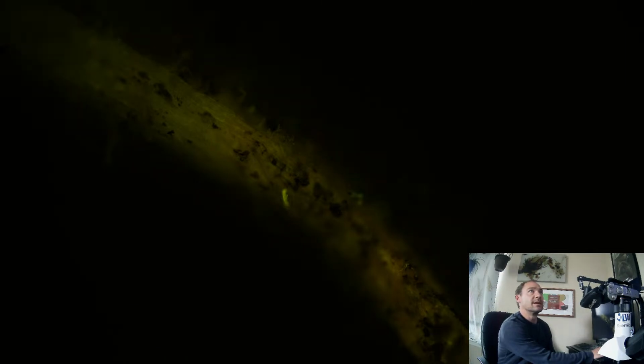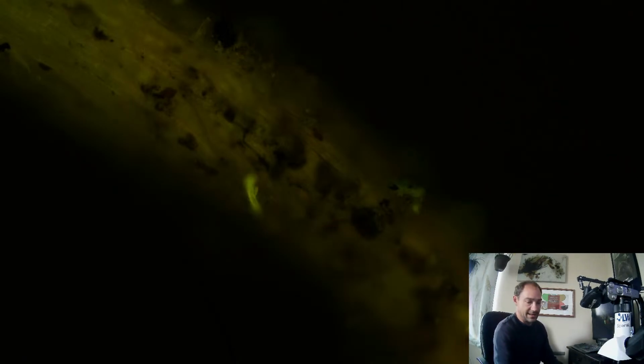Here we can zoom in. We'll go into 2x, and it's interesting. We already see this black line right here. That's definitely a fungal hyphae. Oh, it doesn't seem like I got my pointer. Oh yeah, I got to do this with my pointer. So this black line going right through here is fungal hyphae. So that's endophytic fungi in a dandelion.